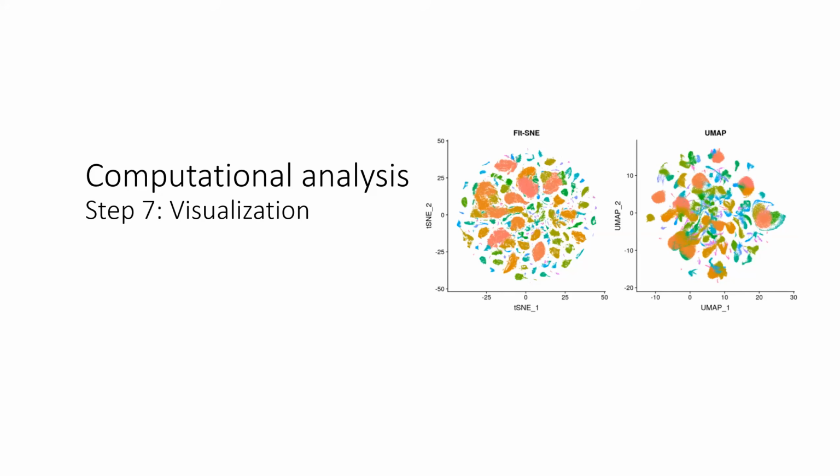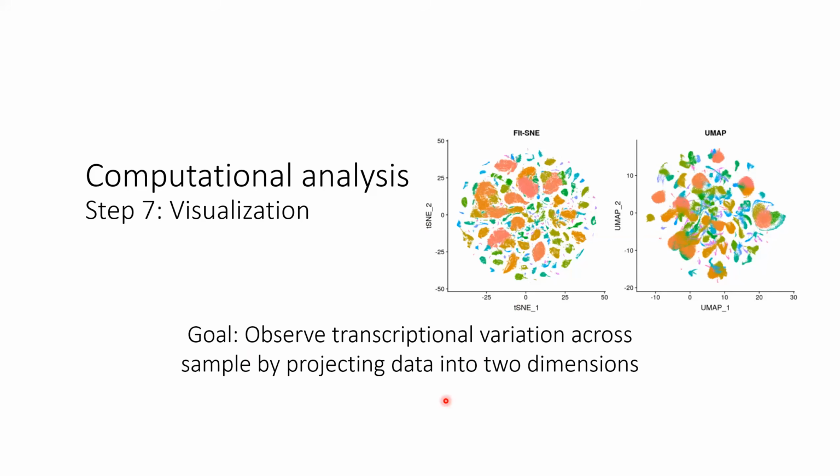Okay. So today's lecture will be much shorter, and we'll end today with a discussion of ways to visualize variation in high dimensional data. And then tomorrow we'll go on to discuss cell type clustering. So UMAP and t-SNE projections are visualization tools that are typically applied to PCA transformed raw data or highly variable gene data. And the goal is to visualize whether cells with known biological markers, gene markers, cluster together in expected ways.